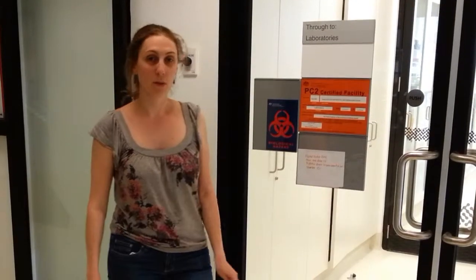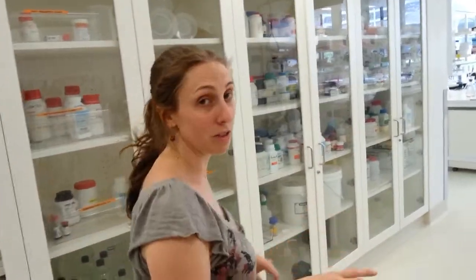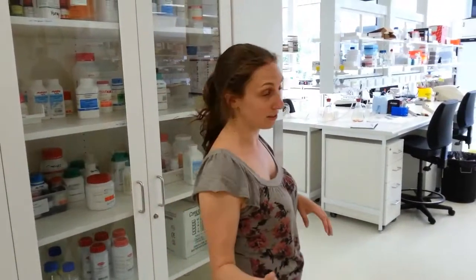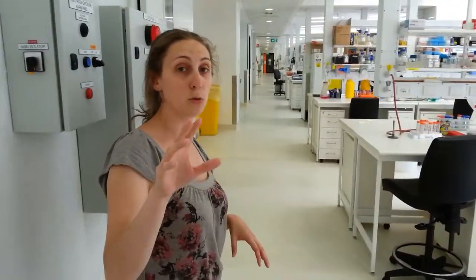It's holiday season at the moment, so while there aren't many people around, I'm going to give you a lab tour. Different kinds of biology labs are classified according to the types of microorganisms being researched in them. And the microorganisms are further categorized into risk groups according to how dangerous they are, that is, how likely they are to infect a person with a disease. There are 4 different kinds of risk groups which are pretty much the same across all countries. The risk groups take into effect things like how likely the organism is to give someone a disease, the mode in which the disease might spread, and how easily we can treat the disease.